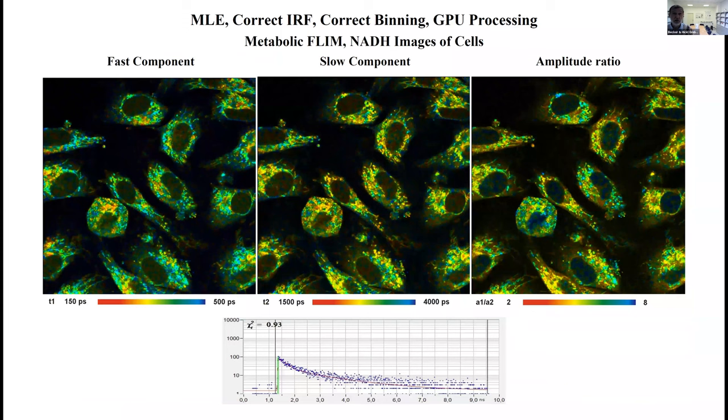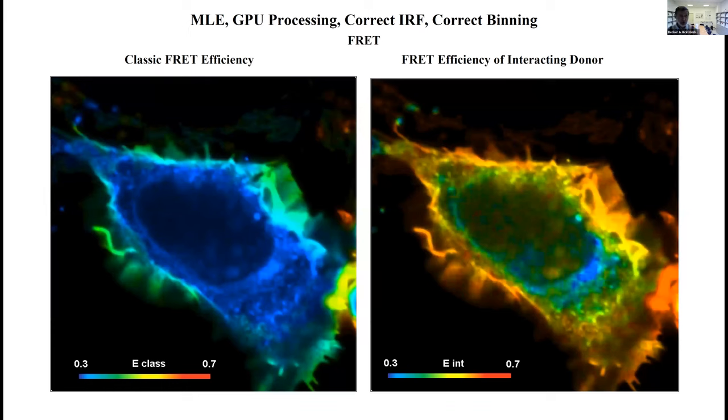This is lifetime of the fast component, this is lifetime of the slow component, this is the amplitude ratio of the two components. This is metabolic FLIM of live cells: fast component, slow component, amplitude ratio. In these things we saw for the first time that different mitochondria in cells may be totally different in the component lifetimes and also in the amplitude ratio. Obviously the metabolism is not exactly the same in different mitochondria.